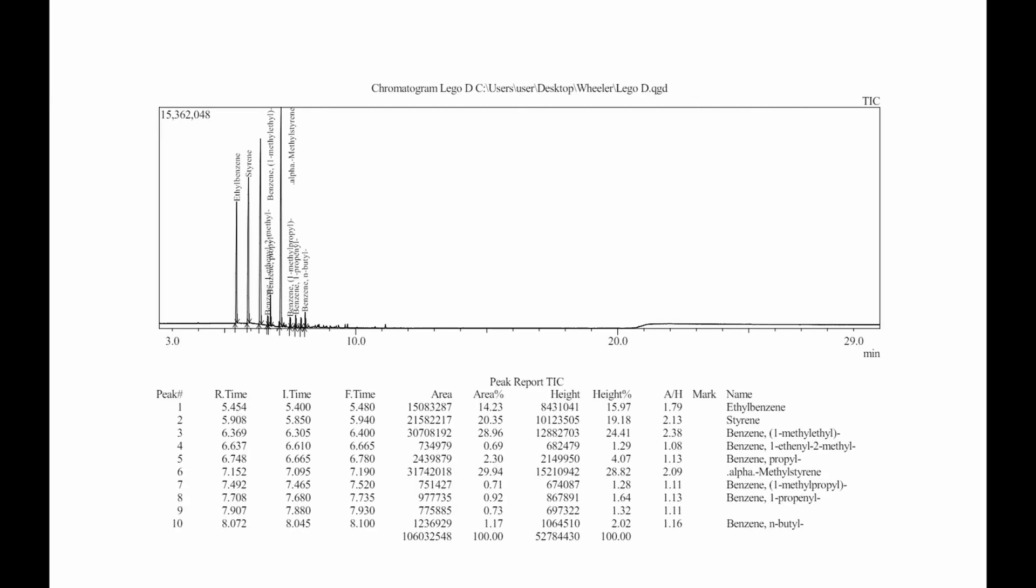The fourth distillate is made up of four main components, again, with the absence of any toluene. We also start to see some higher boiling point compounds come over, such as N-butylbenzene.